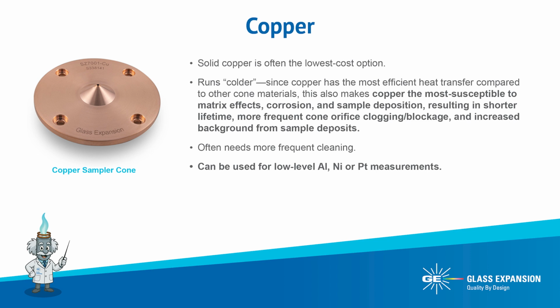Since copper is more vulnerable to sample buildup, these cones will require more frequent cleaning. More frequent cleaning periods result in the ICP-MS being idle longer without running samples. This is an important factor to keep in mind for high-volume testing labs.